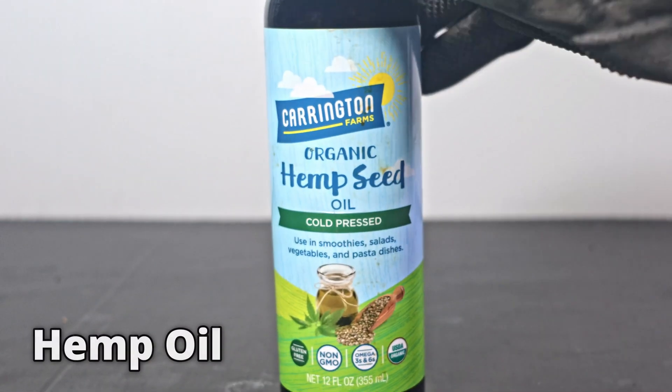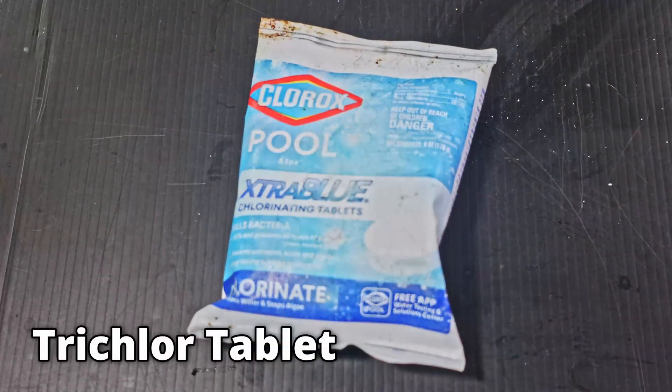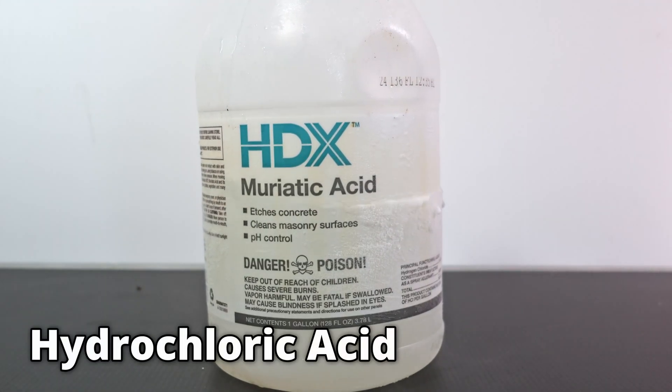The materials you need are hemp oil, pool tablets, and hydrochloric acid.